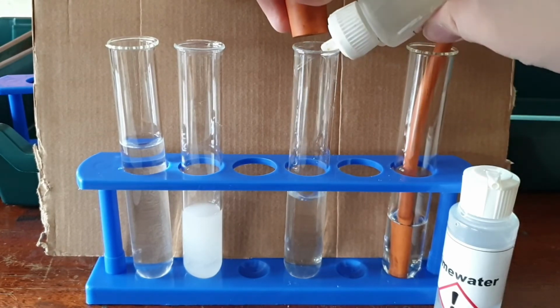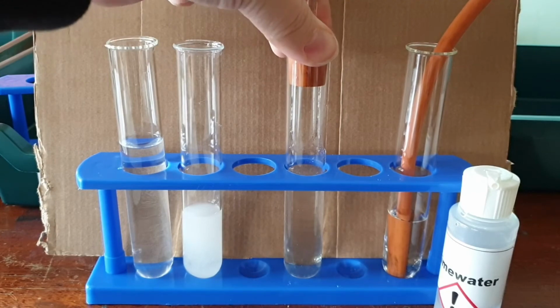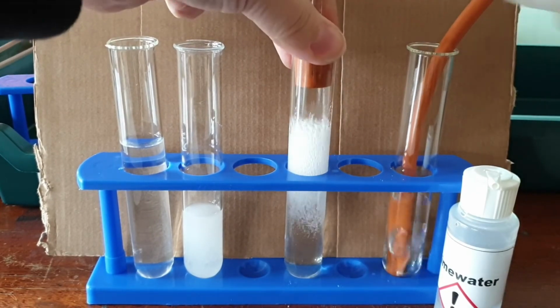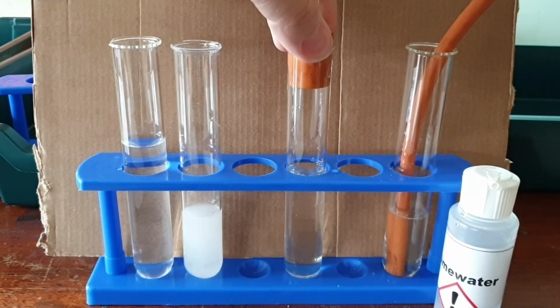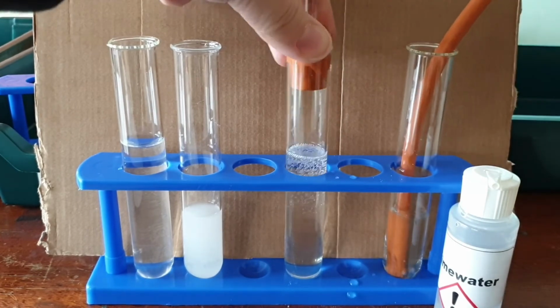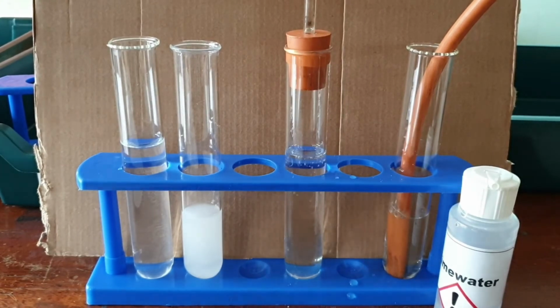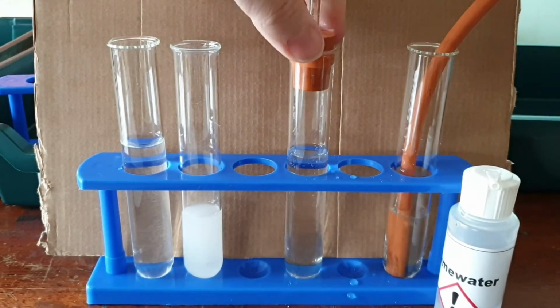Maybe I'll add some more. There we go. Still not quite enough to go cloudy. Okay, failure. Maybe it's too much the other way.